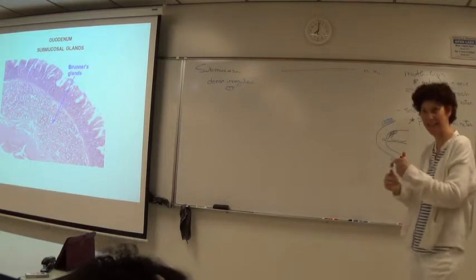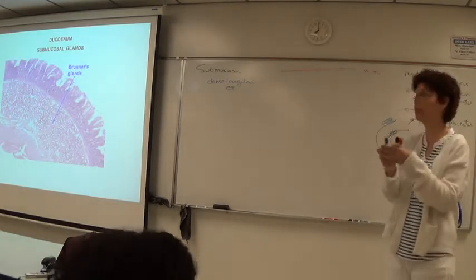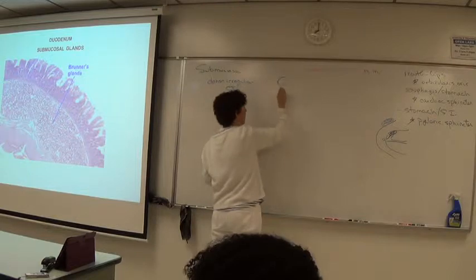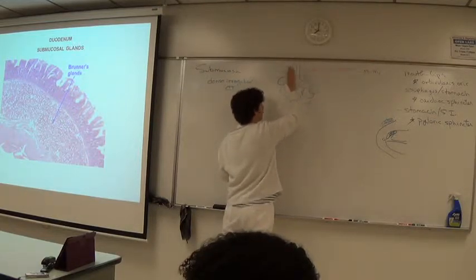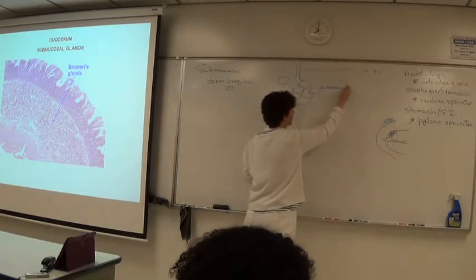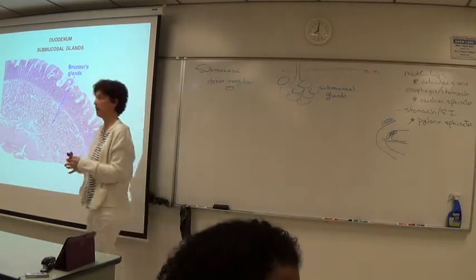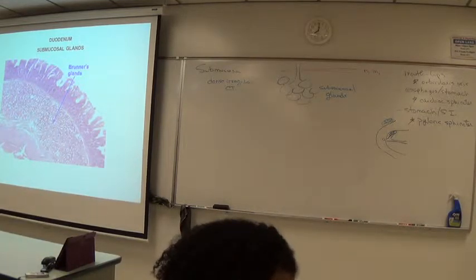Again, they're not goblet cells, they're mucus secreting cells similar to our sublingual gland. And so these are specialized high concentrations via a duct, similar to the distal esophagus, secreting additional mucus that protects the surface of the small intestine, well, specifically the proximal duodenum.